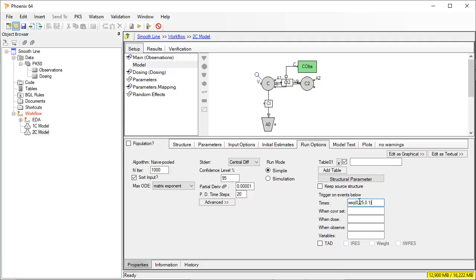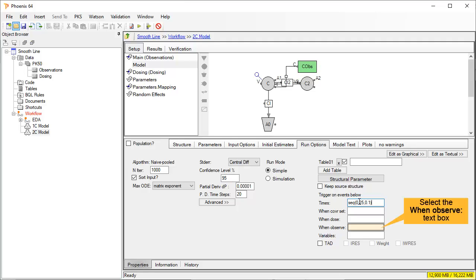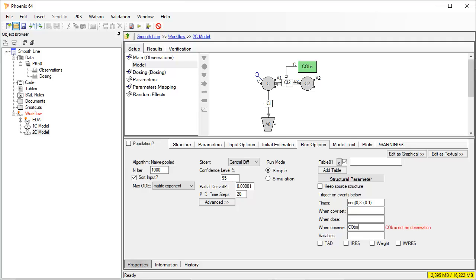In the worksheet, we would also like the values of the observed concentrations when they were measured. We can see in the model diagram that the observations are called COBS. We type COBS in the field when observed. This tool is case sensitive.